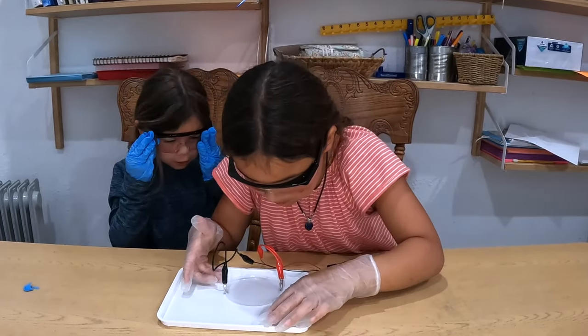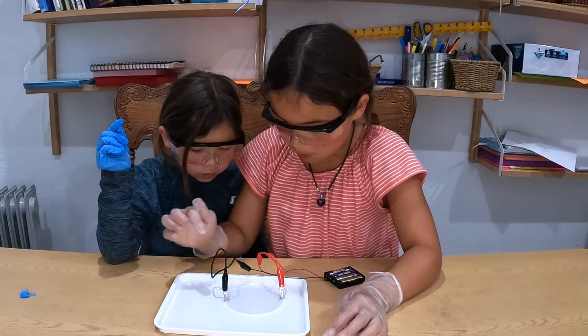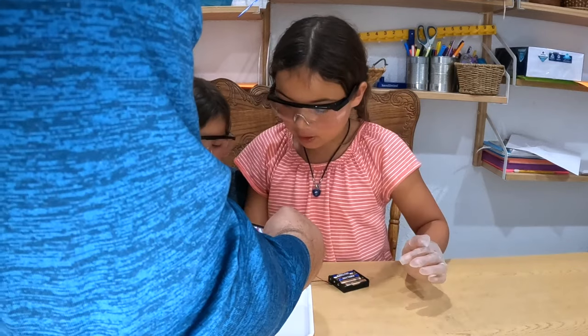I can already see it forming! Me too — on this side I can see it. Don't move it, it's forming. You're going to see little metal things popping out of the black one and it's already starting.